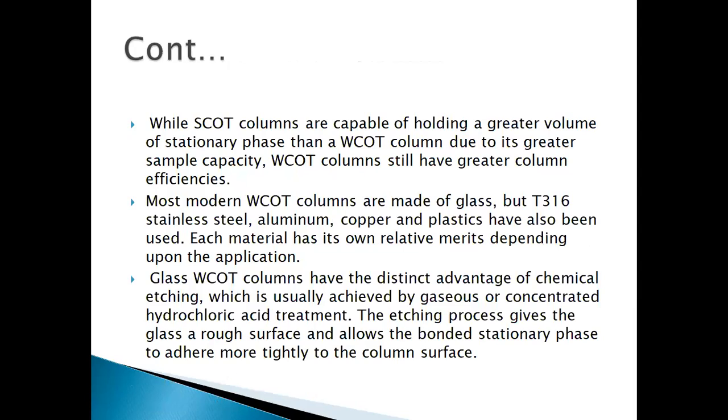While support-coated open tubular columns are capable of holding a greater volume of stationary phase than a WCOT column, due to their greater sample capacity. Most modern WCOT columns are made of glass, but T316 stainless steel, aluminium, copper, and plastic have been used. Each material has its own relative merits depending upon the application.